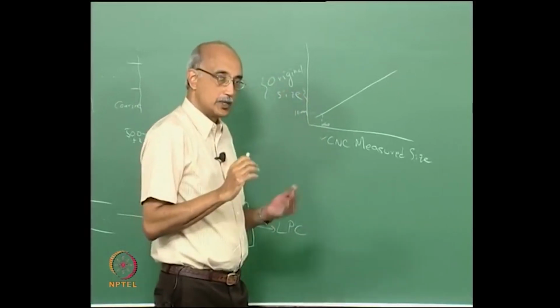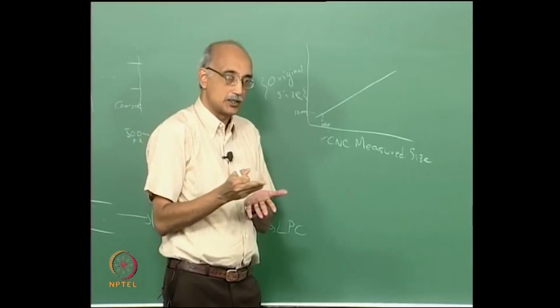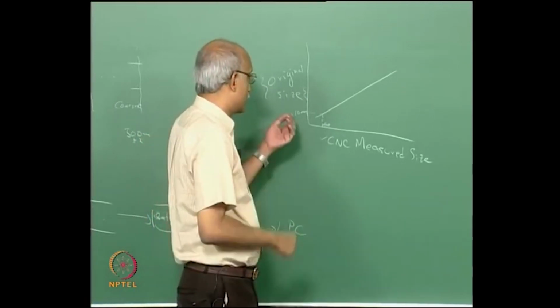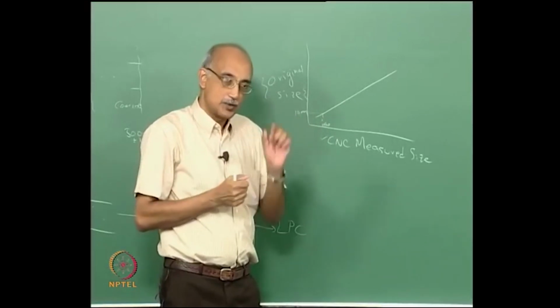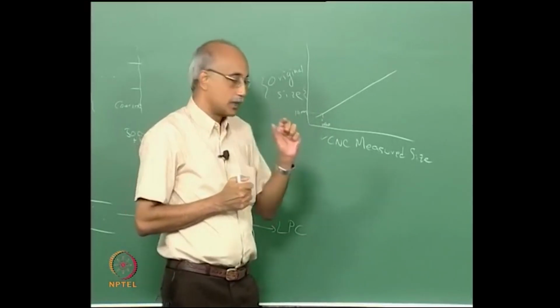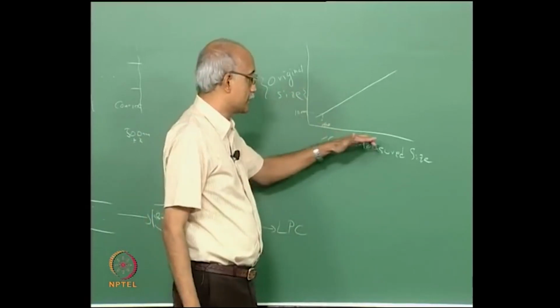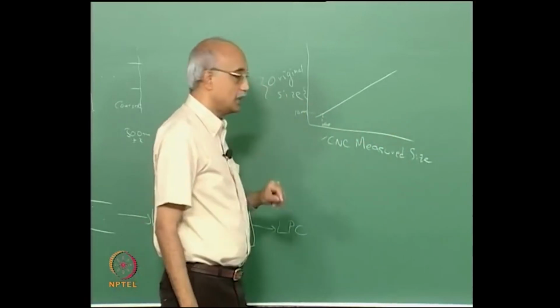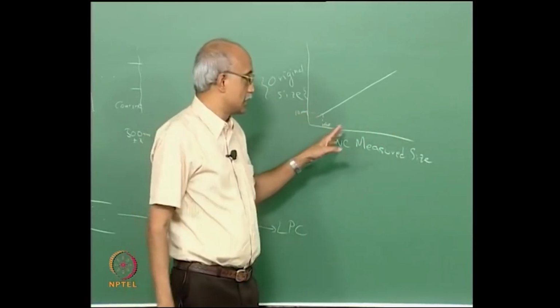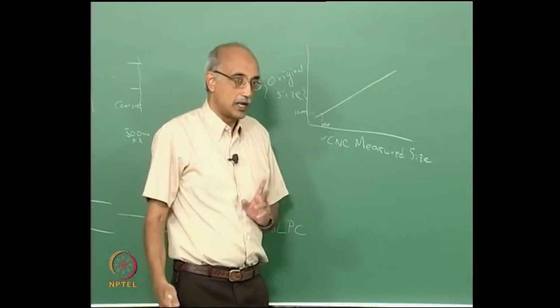In other words, because you know the mobility of the particle as a function of its particle size, you know that particles that are captured in the first mesh have to be within a certain size range, and therefore you can establish what the size is. Similarly, for each of the measured sizes, you can theoretically calculate what this is and develop this line. That is one way to do the calibration.